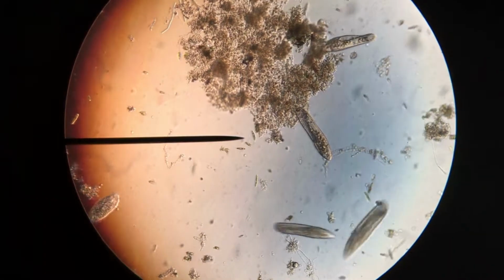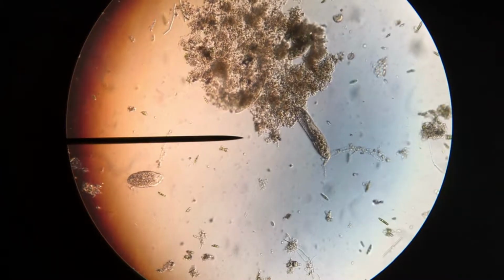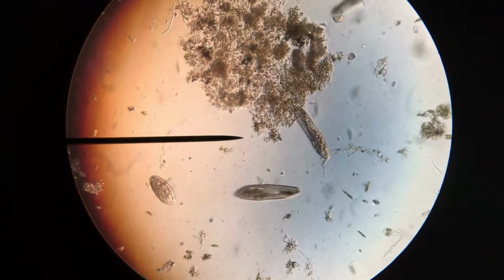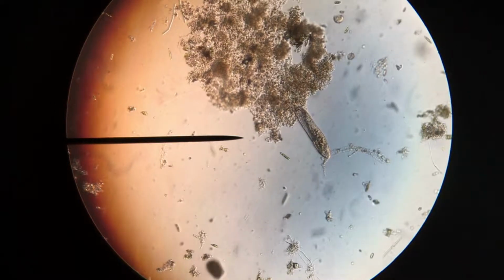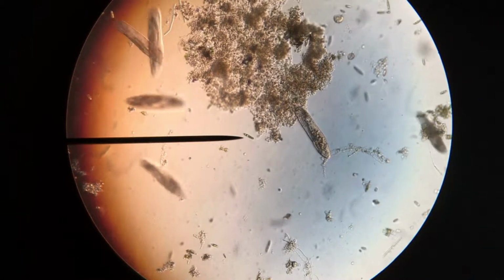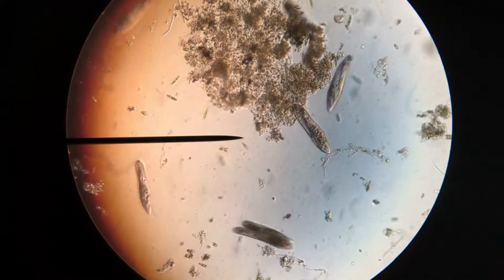Okay, here we have a sample taken from the bottom of your mini pond on Friday, March 15th. This is what you might have seen had you taken a sample, had we had lab today, from the bottom of your mini pond. This magnification is 100. I've got 10 on my objective lens and 10 on my eyepiece.